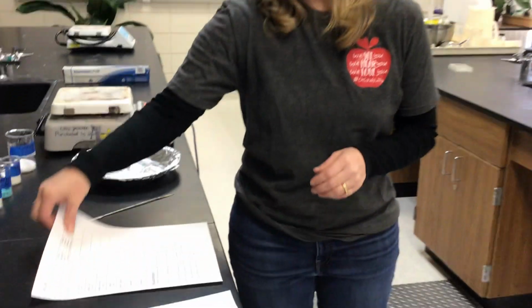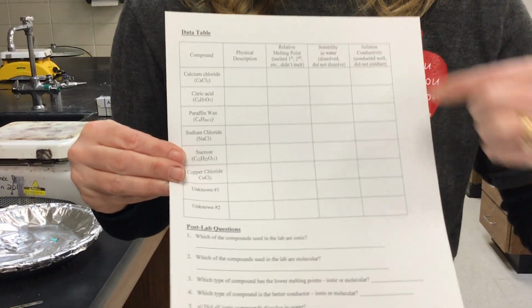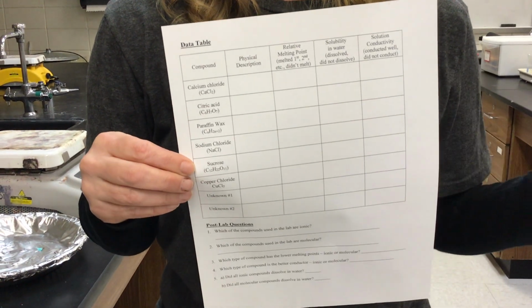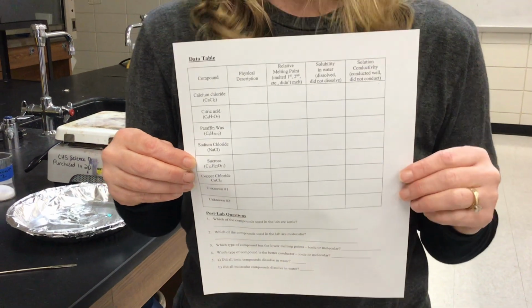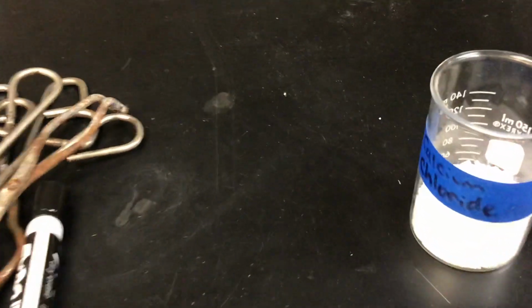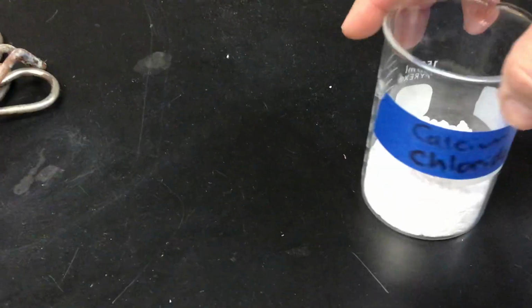Now, you have a data table, okay? And in your data table, you are going to be filling in the information as we do the test, okay? So it'll be a little difficult if you don't have that pulled up, because you'll be wanting to type or fill that out, okay? So let's get started. Now, Ms. Bunch is going to zoom in, and she's going to show you what each thing looks like. So you need to record the physical appearance of each one.